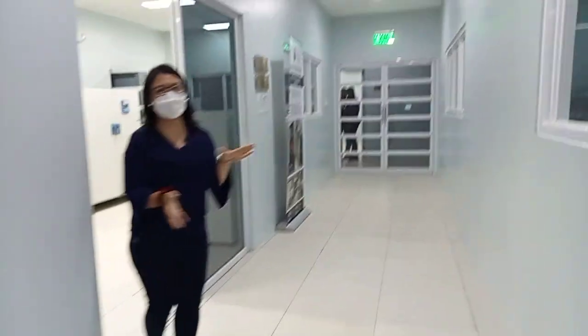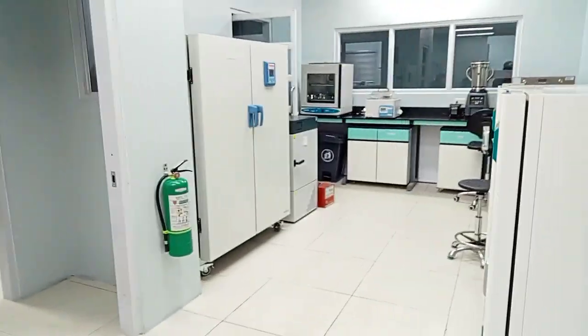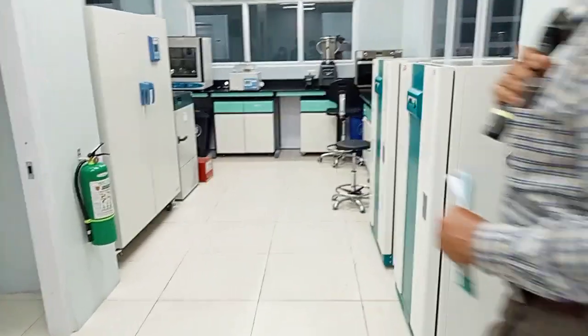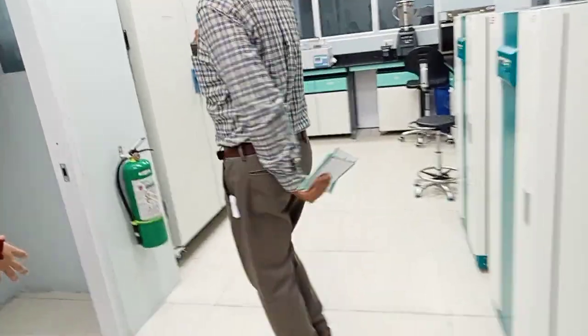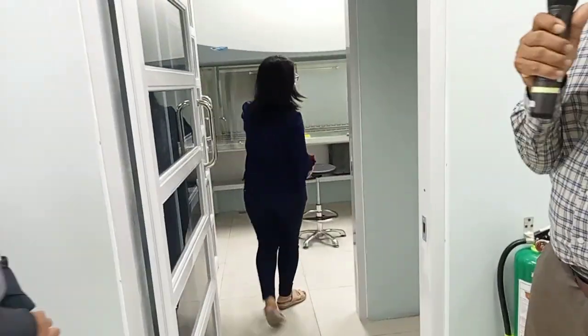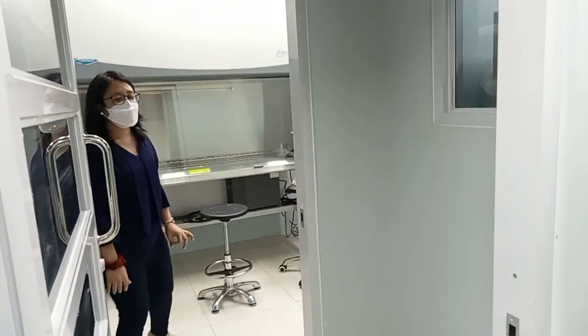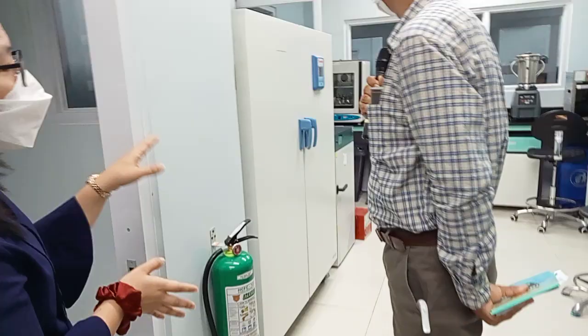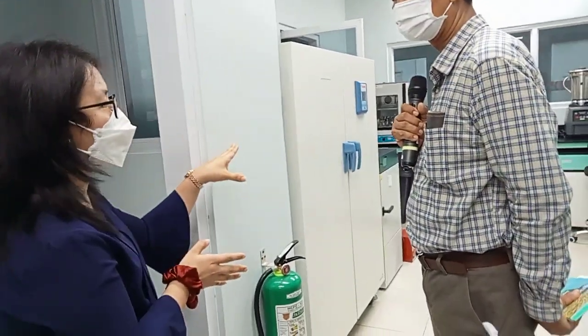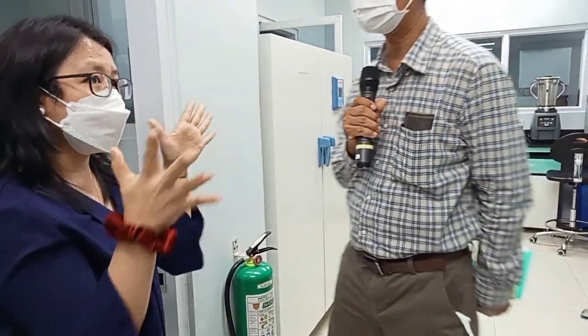For those research which involve plant diseases, what we do here, so for example, we have the creation of diagnostic tools. So here we have the isolation of bacteria, viruses here. So the laminar flow. Lab, we have also separate equipment which is almost similar to the other room so that we avoid the contamination.